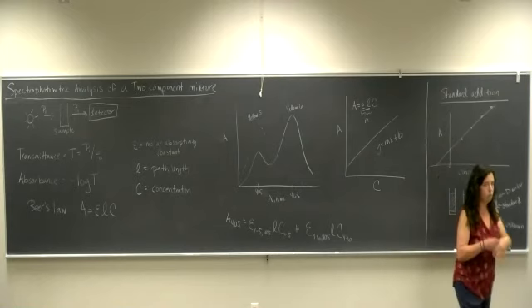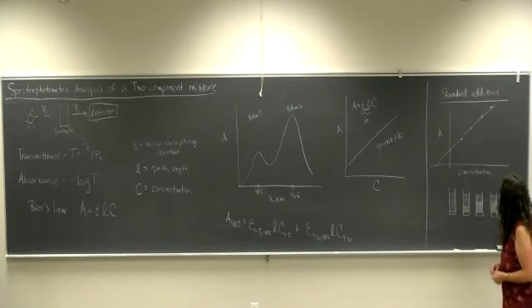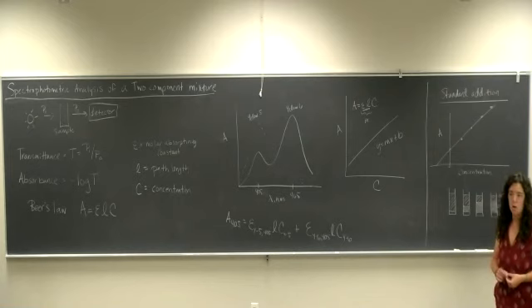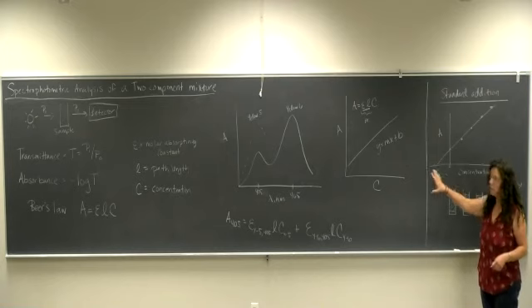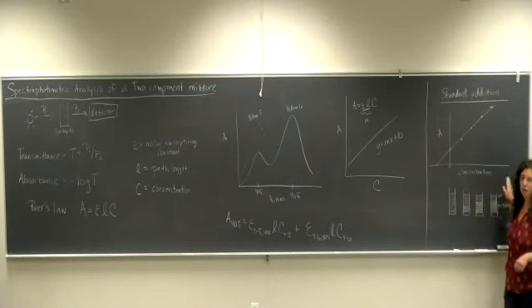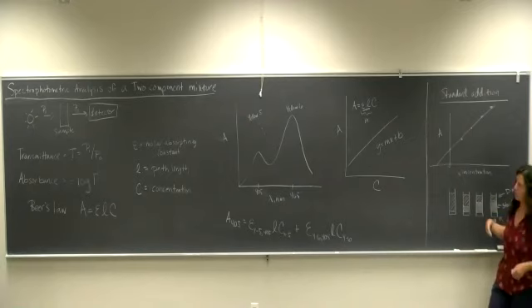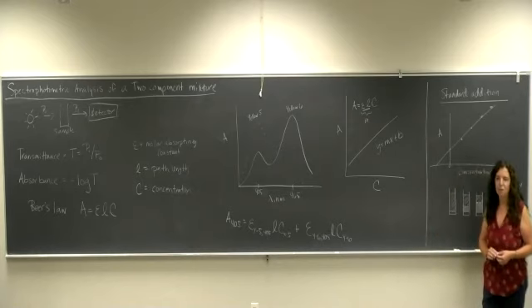And then you will do a little math that we're guided through in the materials to calculate the concentration of the unknown. This becomes a little bit faster than the standard calibration, because you don't have to make your standard plots and then test the unknown. You're testing everything all at the same time. This would be a little more complicated if you had a 2-component mixture, and so that's why we're not doing it with a 2-component mixture. We're just doing it with the yellow 6 dye.